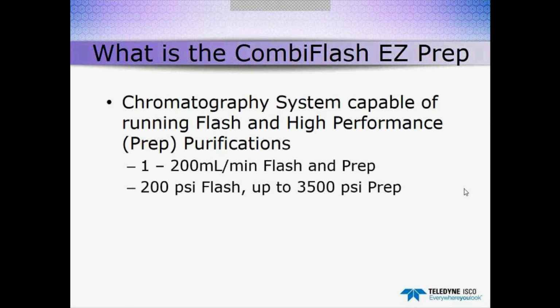200 psi on the flash side, and on the prep side it goes up to 3,500 psi. So the 200 psi side is simply software limited because the plastic columns can't withstand pressures much above the 200 psi mark.